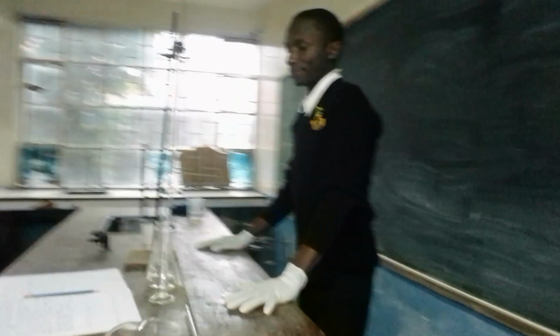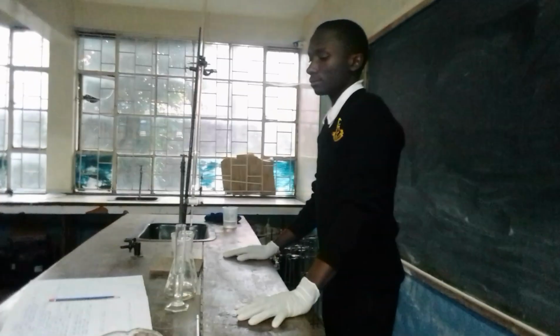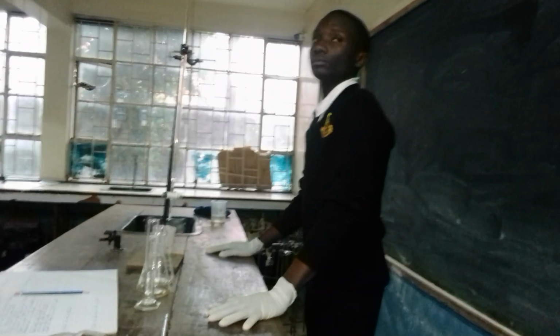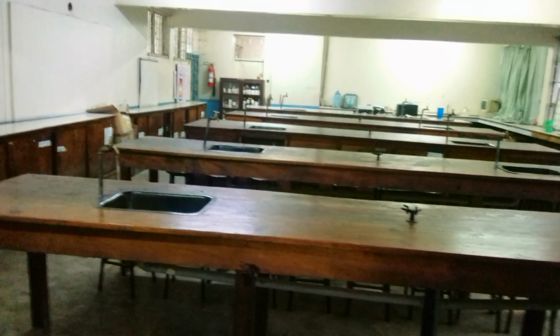So according to the procedure here, we are just going to go through the procedure as per instructed first, so that you can know what we are exactly doing. Before we do anything else, I will tell Alan to read the procedure here within the book, so that we know the kind of procedure that you are supposed to follow.